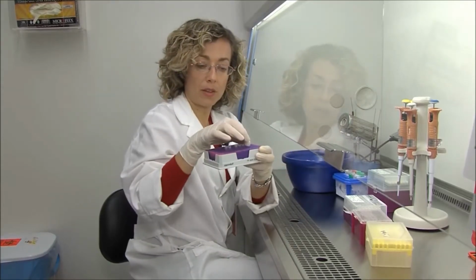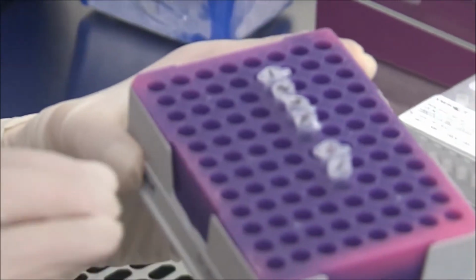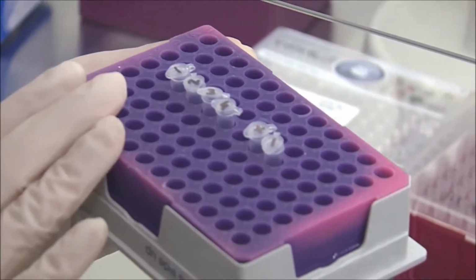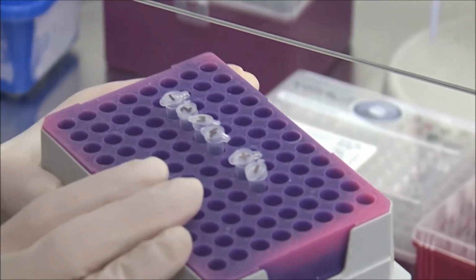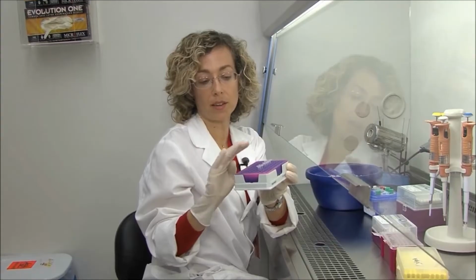These are the PCR tubes that we are going to use. These are 0.2 ml tubes. And I'm using an ice block. So they are going to be also maintained at minus 10 degrees Celsius or so. So again, it's very important that all the reagents at all times are cool.